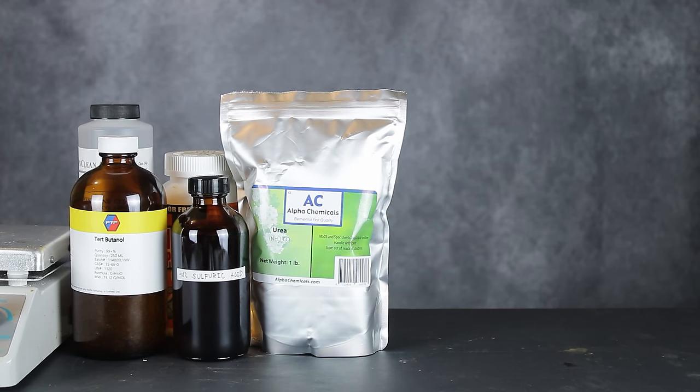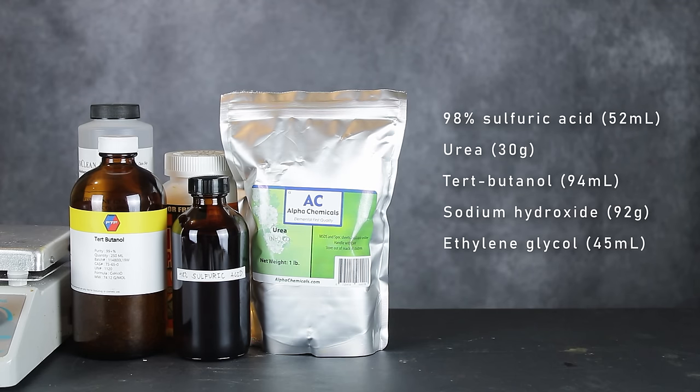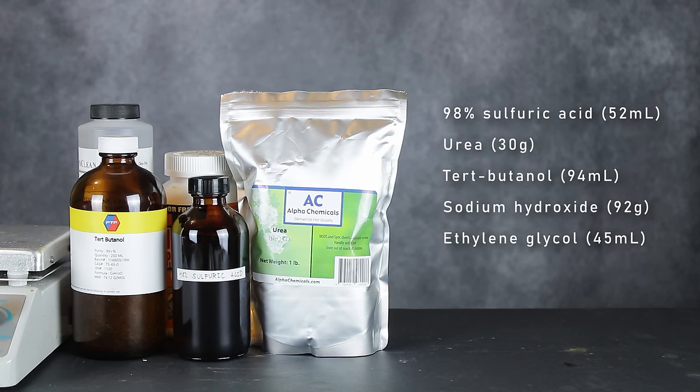To make tert-butylamine, the following reagents are necessary: 98% sulfuric acid, urea, tert-butyl alcohol, sodium hydroxide, and ethylene glycol. Almost all of these can be bought on Amazon, but I had to concentrate the sulfuric acid myself by boiling drain opener.